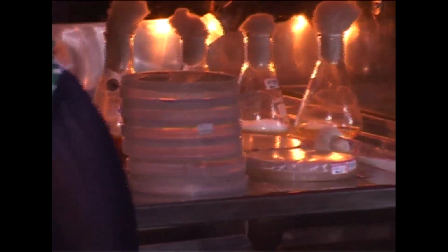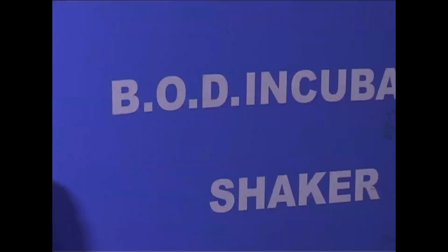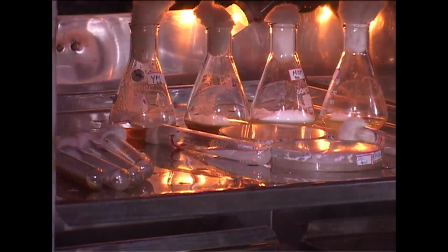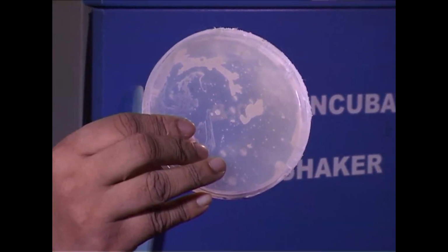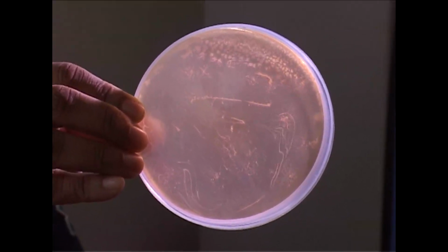Rhizobium grows very well at this temperature and can be kept for 2 days or 48 hours. The plate should be inverted while you are keeping it in the incubator. Then once you have waited the 48 hours, you will observe for growth on the petri plates. If you take yeast extract mannitol medium, you will see watery colonies like this, or white colonies. If you take the Congo red medium, you will also see some light pinkish colonies which are obviously of Rhizobium species. If there are other organisms present, they will be darker in color.